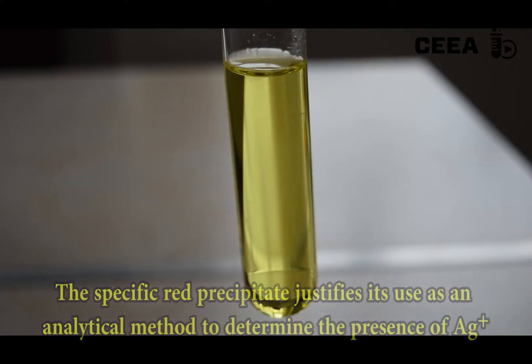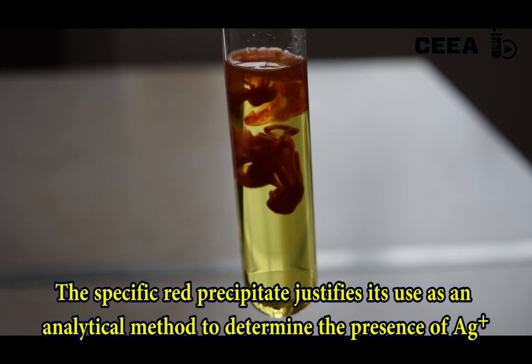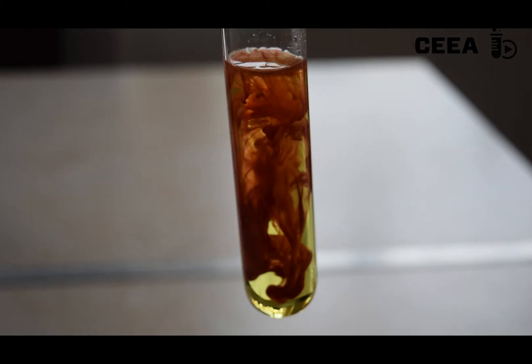As chromate ions form this red precipitate only with silver, the reaction is specific, and it is used to identify silver ions in a solution.